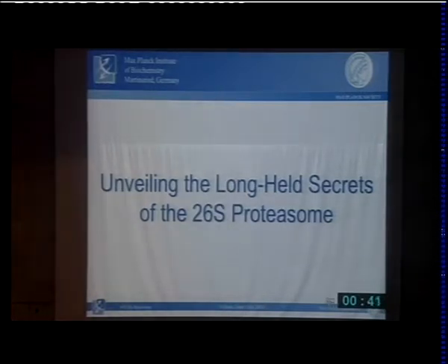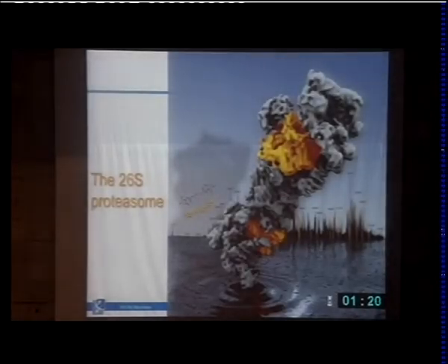Then in the next part, I will give you at least a glimpse of the dynamics of this molecular machine, a picture that is still substantially incomplete, but at least I think it will show you the range of the dynamics. And in the last part, I will show you something that is work in progress, and that are structural studies of the 26S proteasome, not in isolation, but in situ, in their intact cellular environment. And for that, I need also to give a little bit of an introduction into cellular electron tomography.